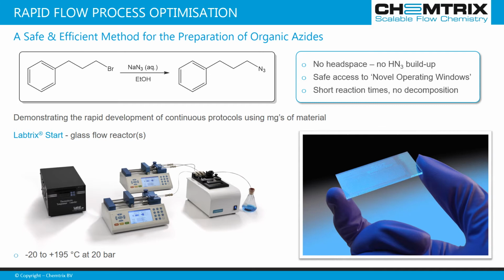So the first piece of chemistry I want to show you today is the preparation of an organic azide. And this is a process that we initially investigated together with an industrial partner, but now on a simpler molecule that I can show you, we're able to do demonstrations generally at flow conferences together with METTLER to show you how quickly you can optimize a process and where PAT brings you a benefit.